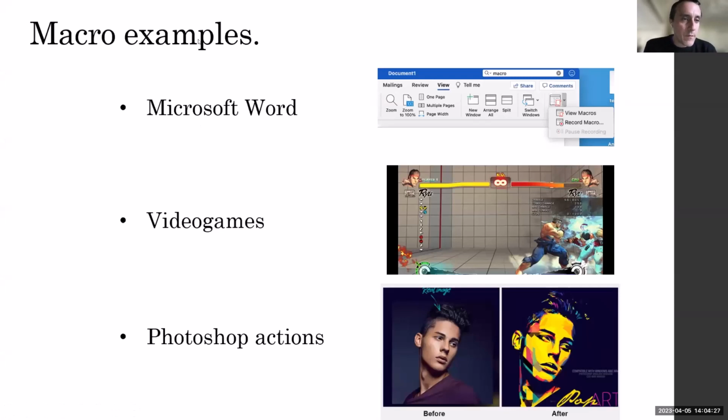Yeah, so macros crop up all over the place. You can find them in Microsoft products. You can use them to cheat in video games if you're so inclined, and Photoshop and other places. Next slide, please, Amy.